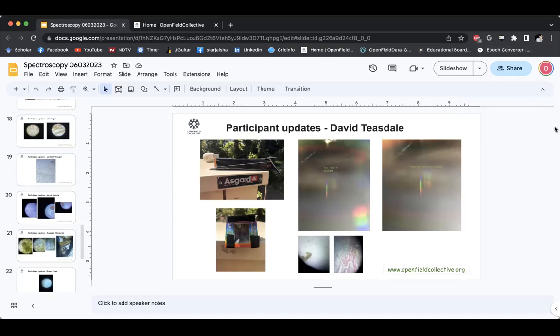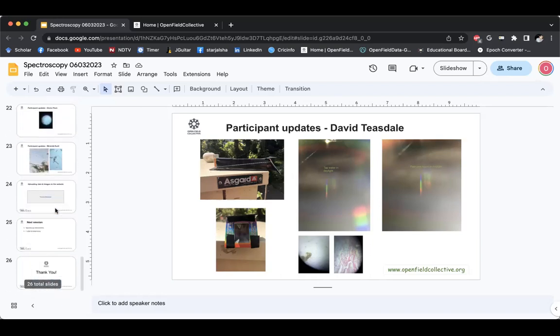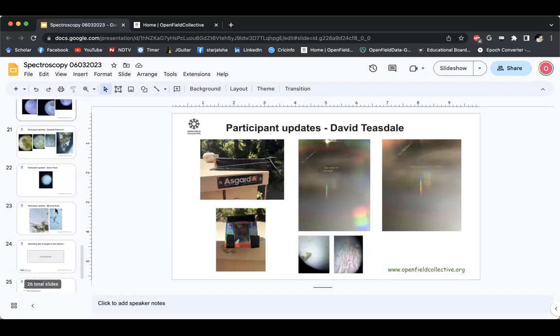Yeah, I think, try light with an indoor lamp that is consistent, because that will stay there with more or less the same intensity for many months, compared to outside. But once you have the box sealed properly, there's only one way light can enter into the chamber. Once you have it sealed properly with the slit, and on the other side with your phone, then you will get only one spectrum.